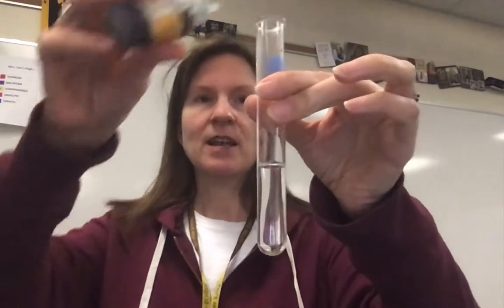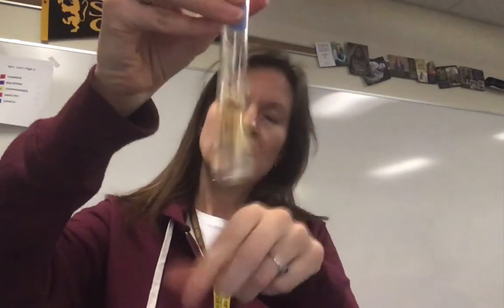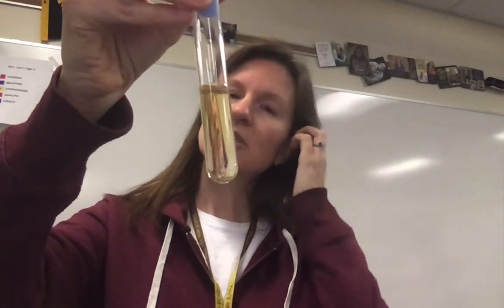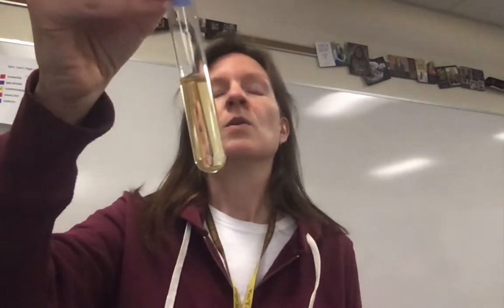Here's test tube number 1 after the reaction's been complete. Put a couple drops of bromothymol blue in it again so we can test for the presence of hydrochloric acid. So what you want to write down in the observation section is obviously what happened during it, but also once it's done right now. What are you observing in order to help you understand what the limiting reactant was and what the excess reactant was once the reaction stopped?